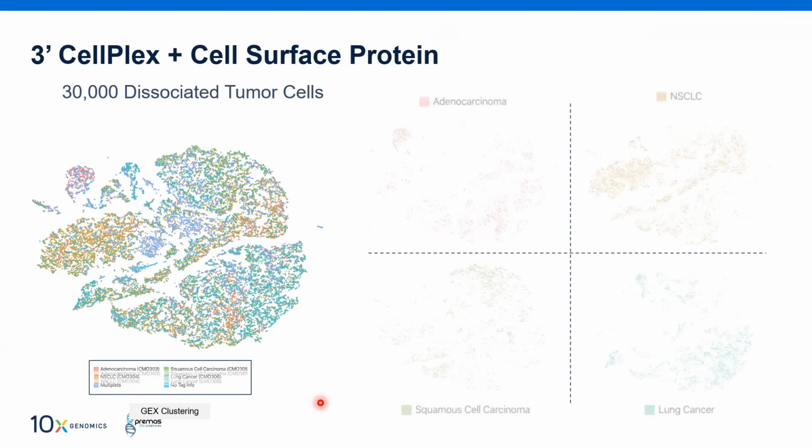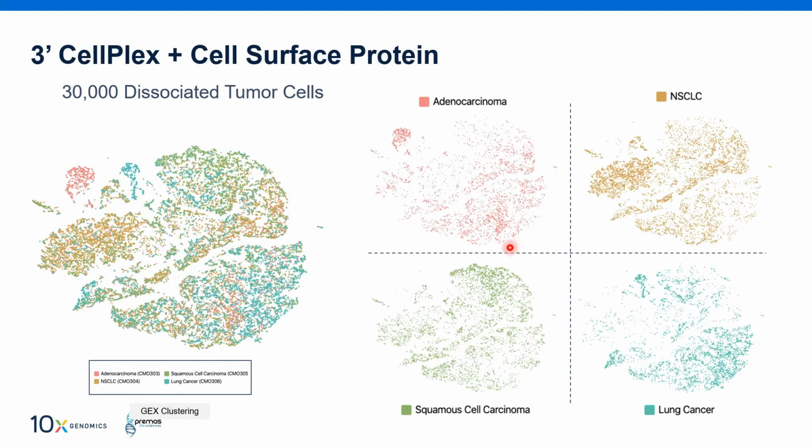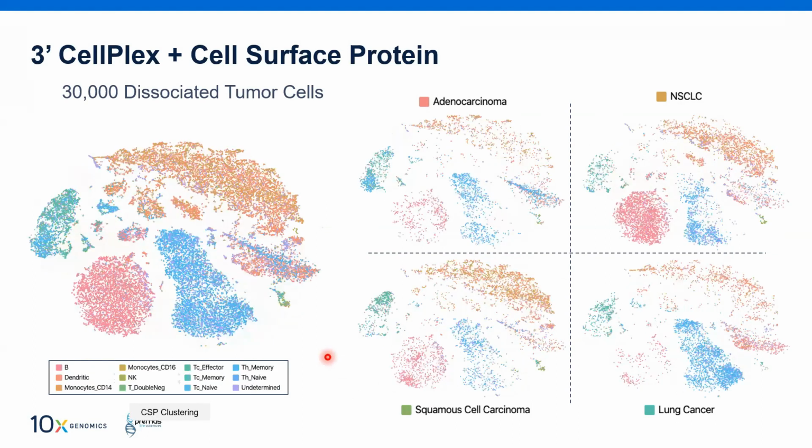So first, you just demultiplex the data based on the cell barcode, so you can easily demultiplex the data into all the antibodies or cell surface protein markers. Around 17 markers were used. Then you are able to see the cell populations. So these are the various cell populations.